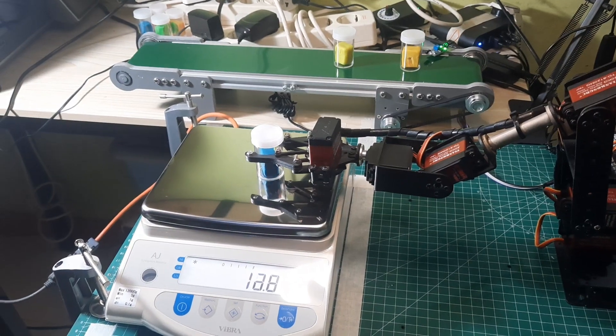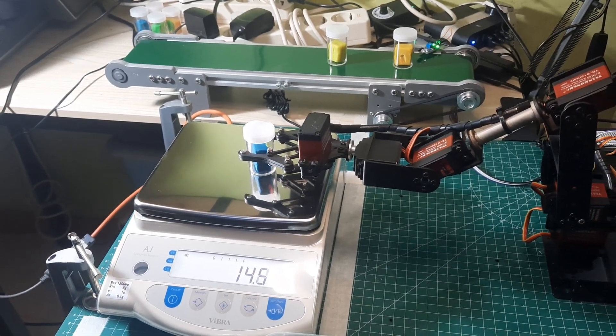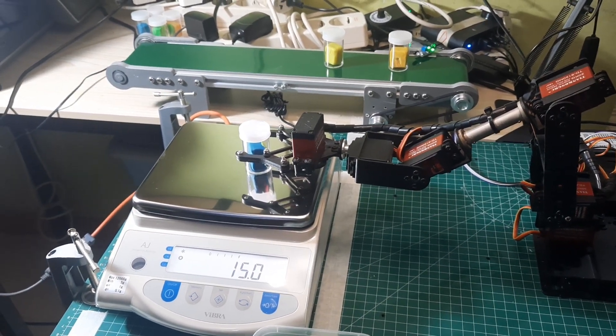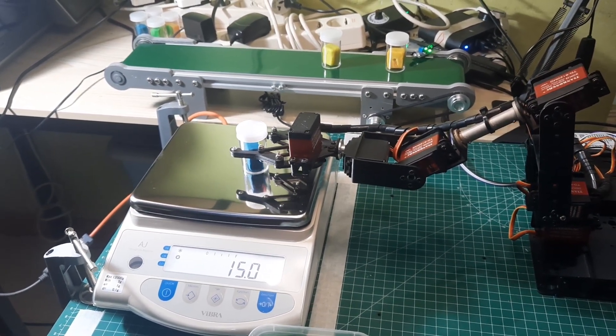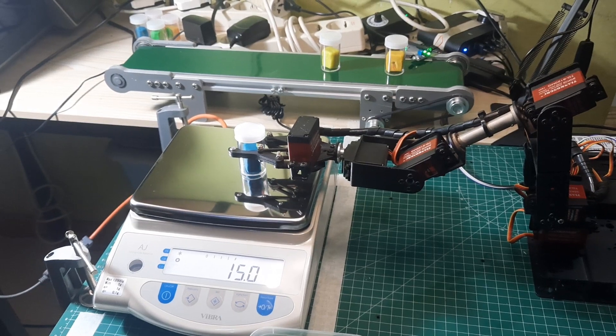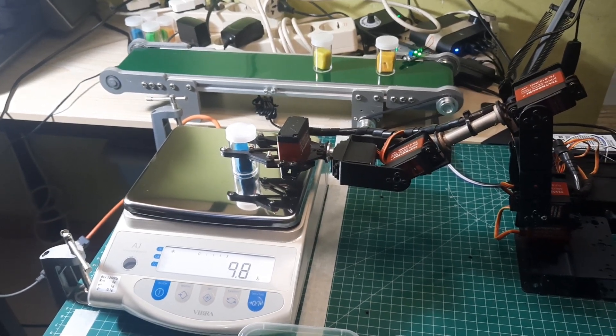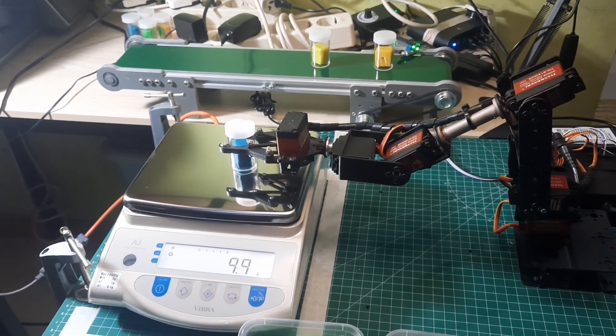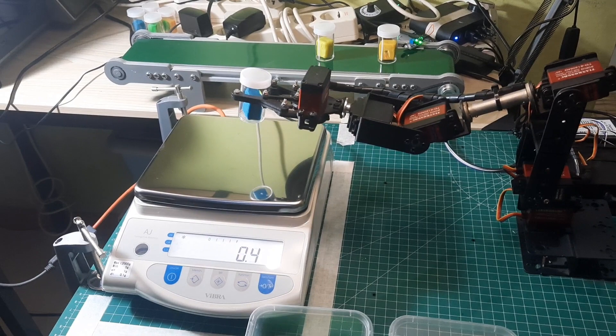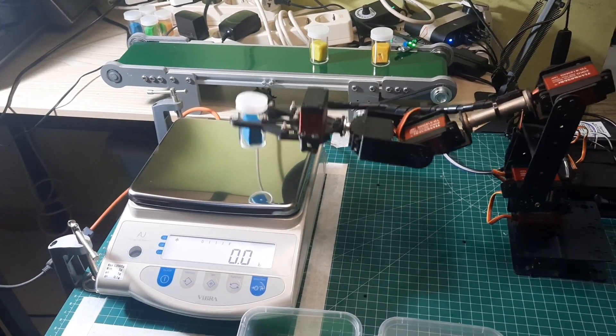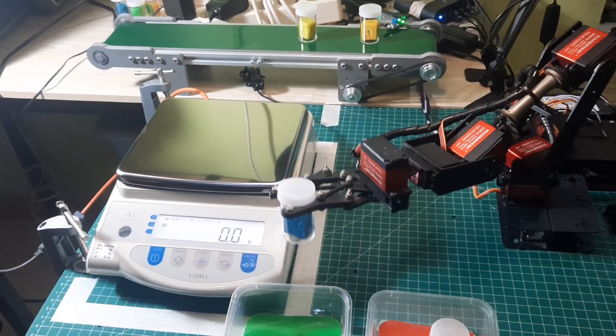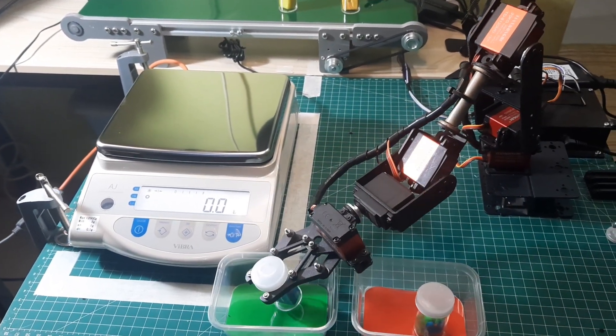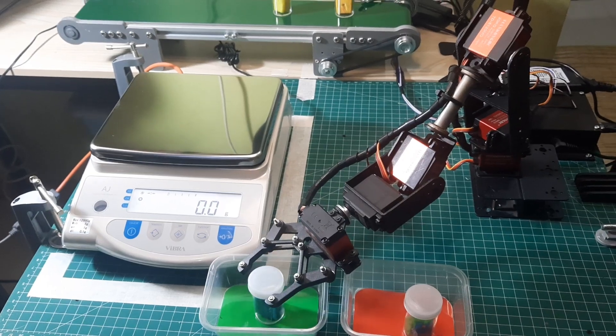But before doing so, the robot will perform a tare to ensure the scale is at zero. The robot will then read the weight and determine if it meets the specification. If the weight is correct, the object will be placed in the green box, and if not, it will be placed in the red box.